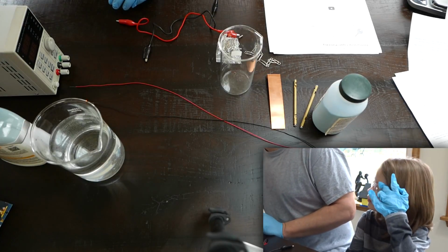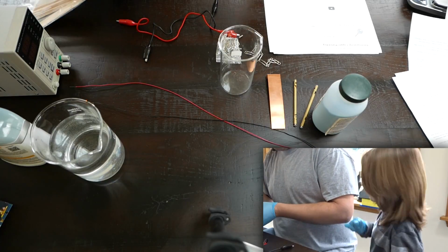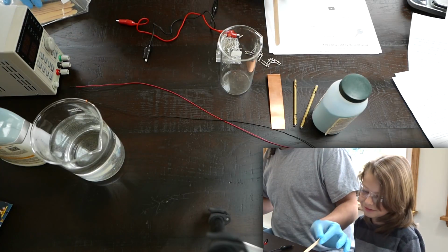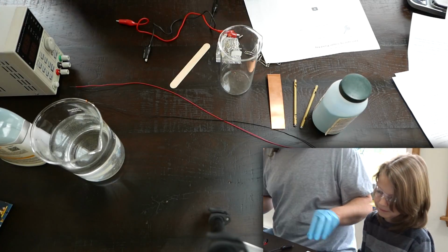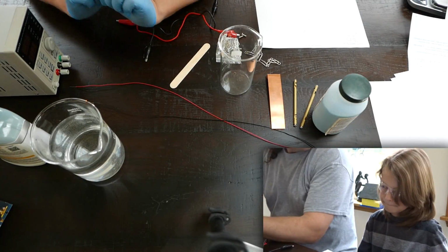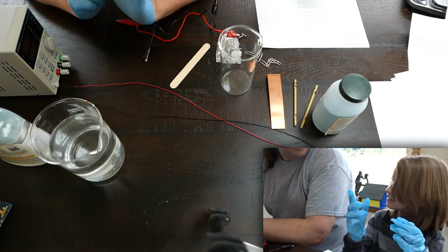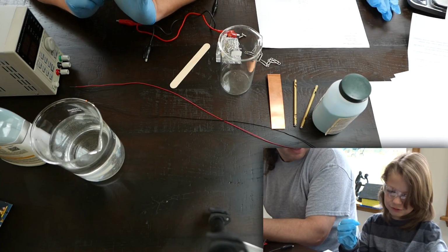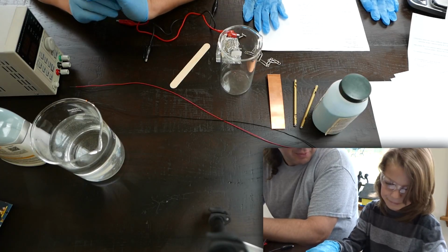Yes, that's why I keep on bothering you. Do not, I'm serious, do not do that again, okay? I will just try not to do it once I start. Yes. Release that. Okay, so keep going. Let's use those sticks. Yeah, we're gonna mix it, I think. All right. How do I not touch anything? I'm touching the air. Don't touch yourself, okay? I could clean the table, I could clean everything else, but so I'm allowed to do this. Yes. Your whole point, you're not supposed to touch yourself.